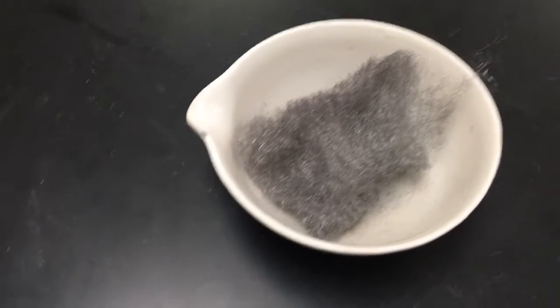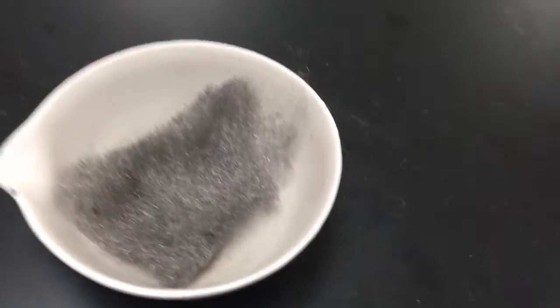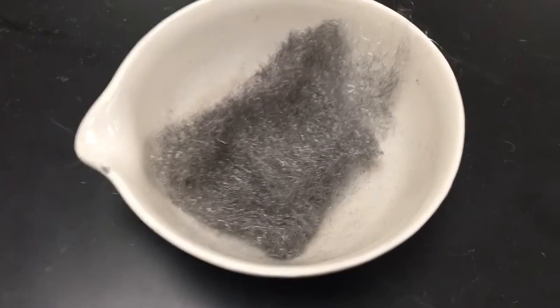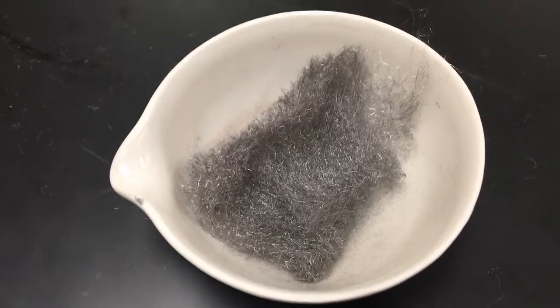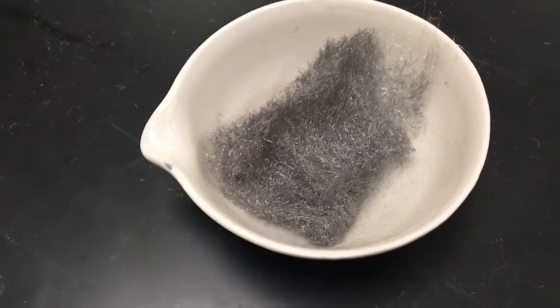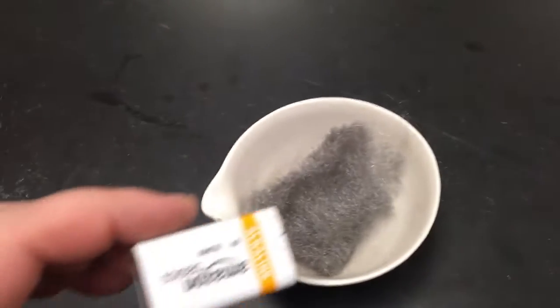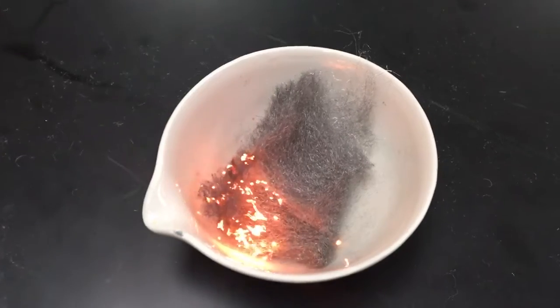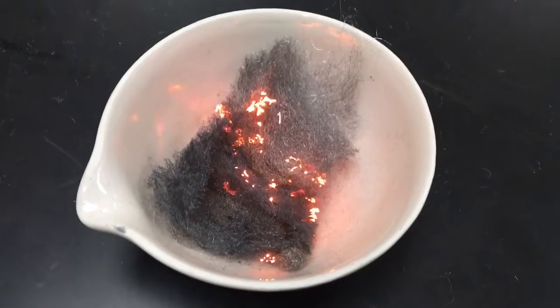And steel wool is steel. It's not wool. It just looks like wool and feels like wool. It's kind of fluffy and a little bit softer than you normally think of steel being. And for this reaction, keep in mind that steel is 99.9% iron, and the other stuff that's in there doesn't really matter. So this is pure iron here in this steel wool. And all we need to do to get this iron reacting is touch it lightly with a battery. The battery is not part of the actual reaction, it just gives it the energy to get going.